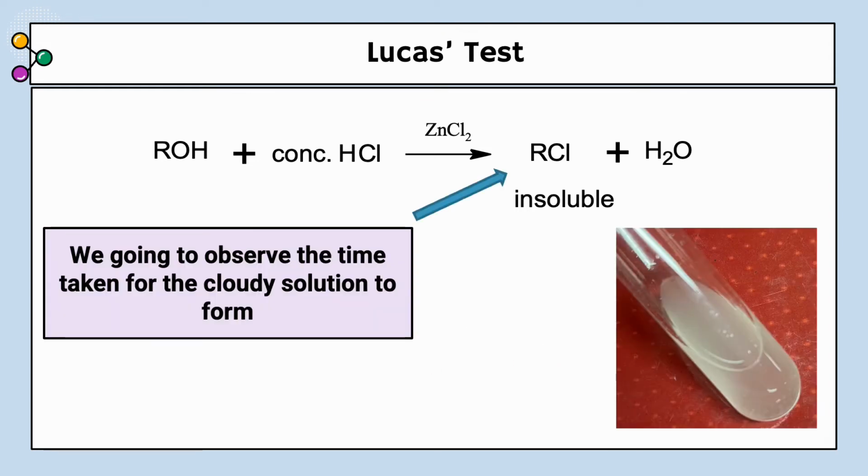So for a Lucas test, what we are going to observe is the time taken for the cloudy solution to appear.